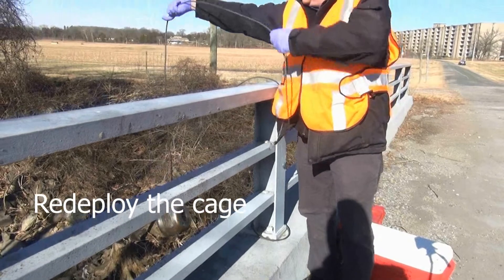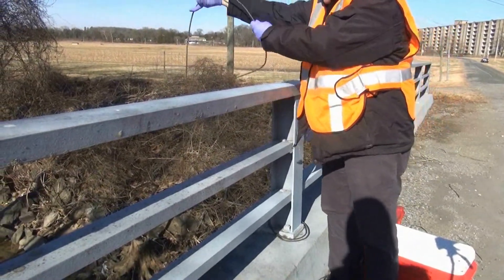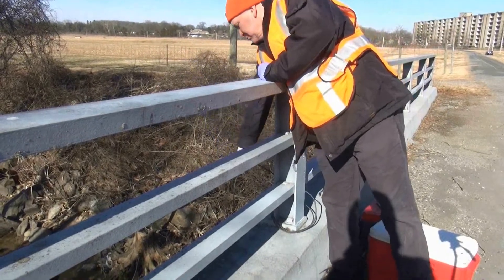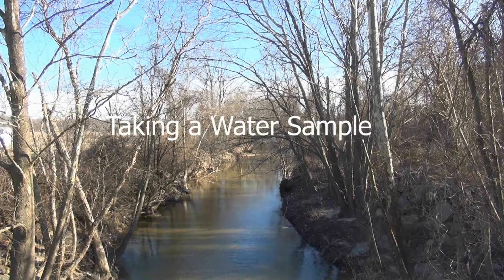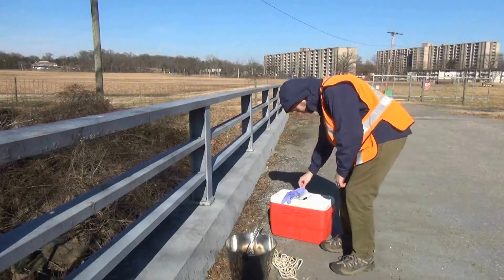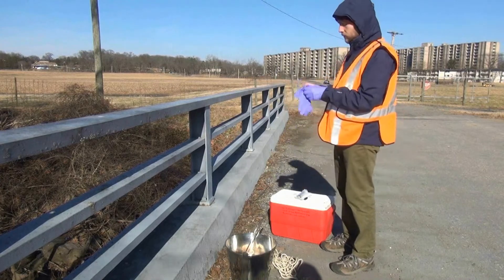Re-deploy the cage into the water. When taking a water sample, be aware of your environment and take any necessary precautions. Gloves are required PPE.